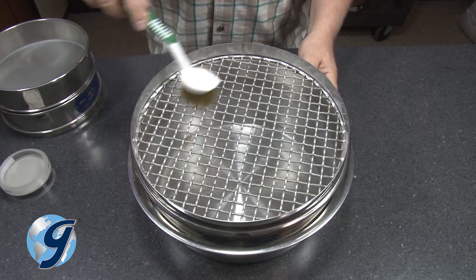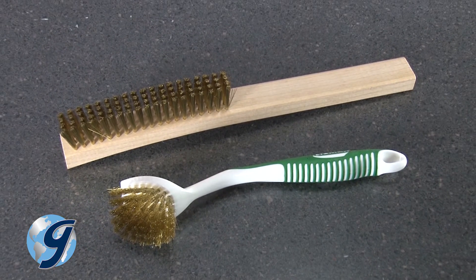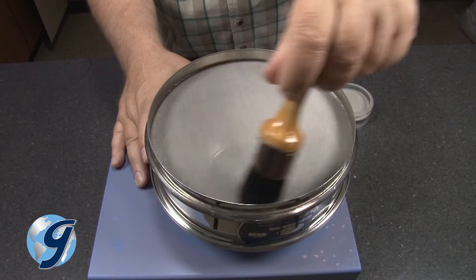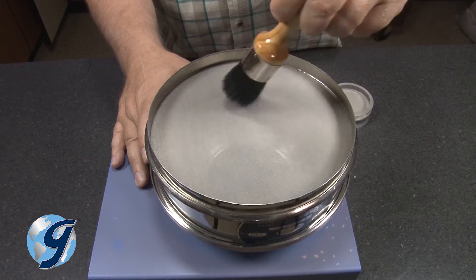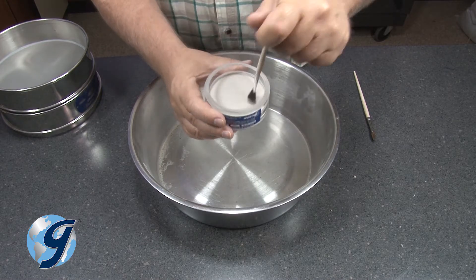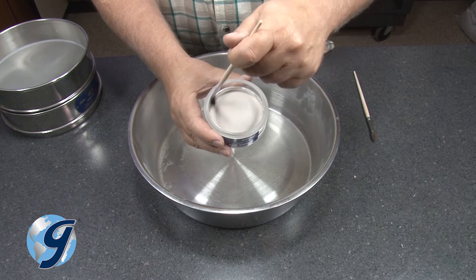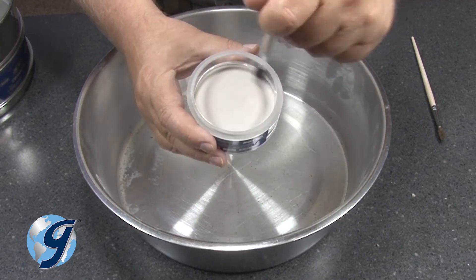Sieves larger than number 4 will require a wire brush for efficient cleaning. Sieves from number 5 to 170 are best cleaned with a medium stiff bristle brush. And for finer mesh sieves, use a soft bristle brush and a light touch to avoid damaging the cloth.